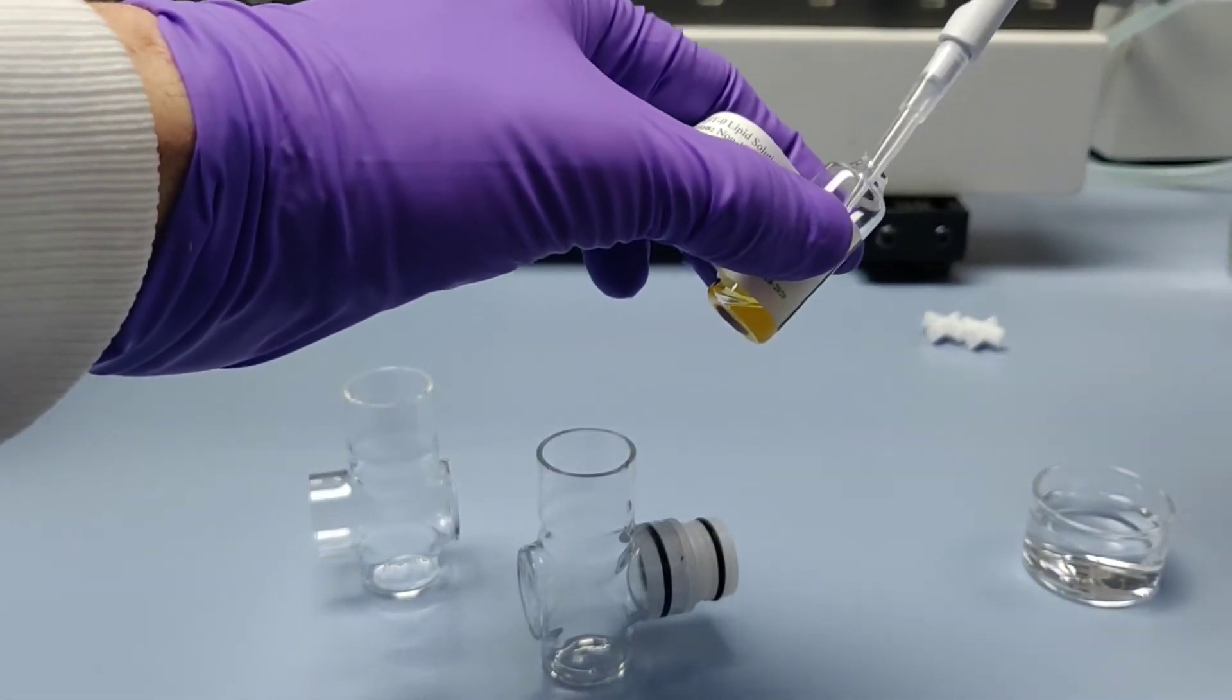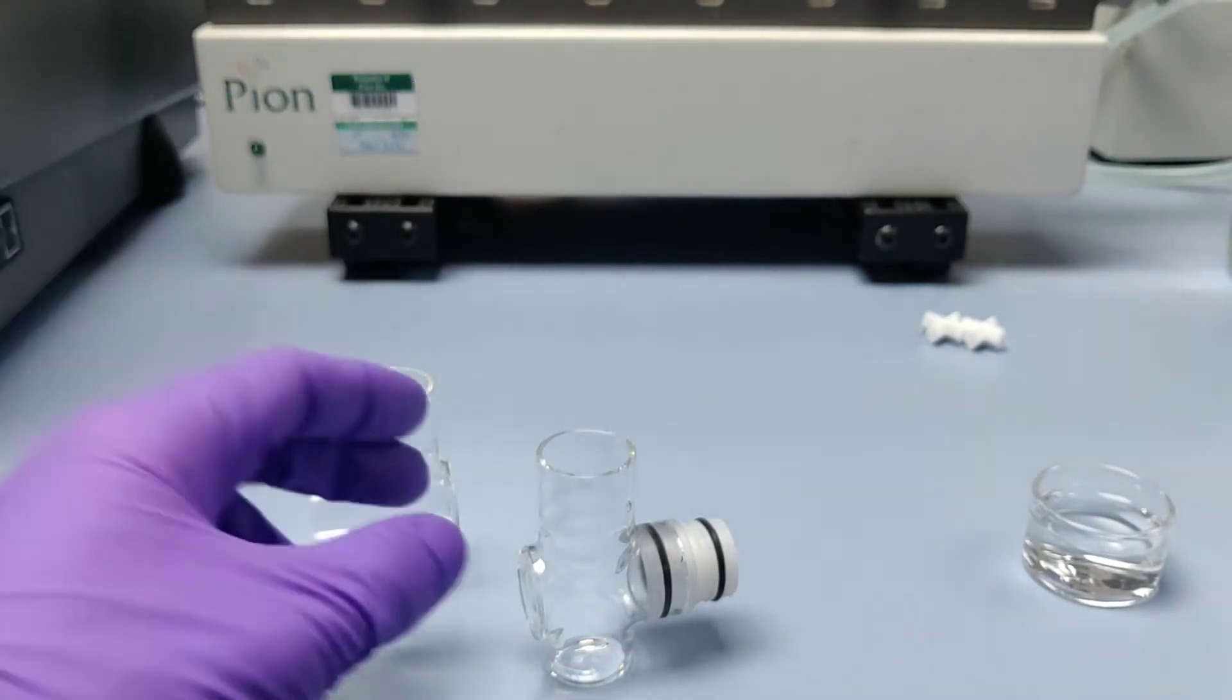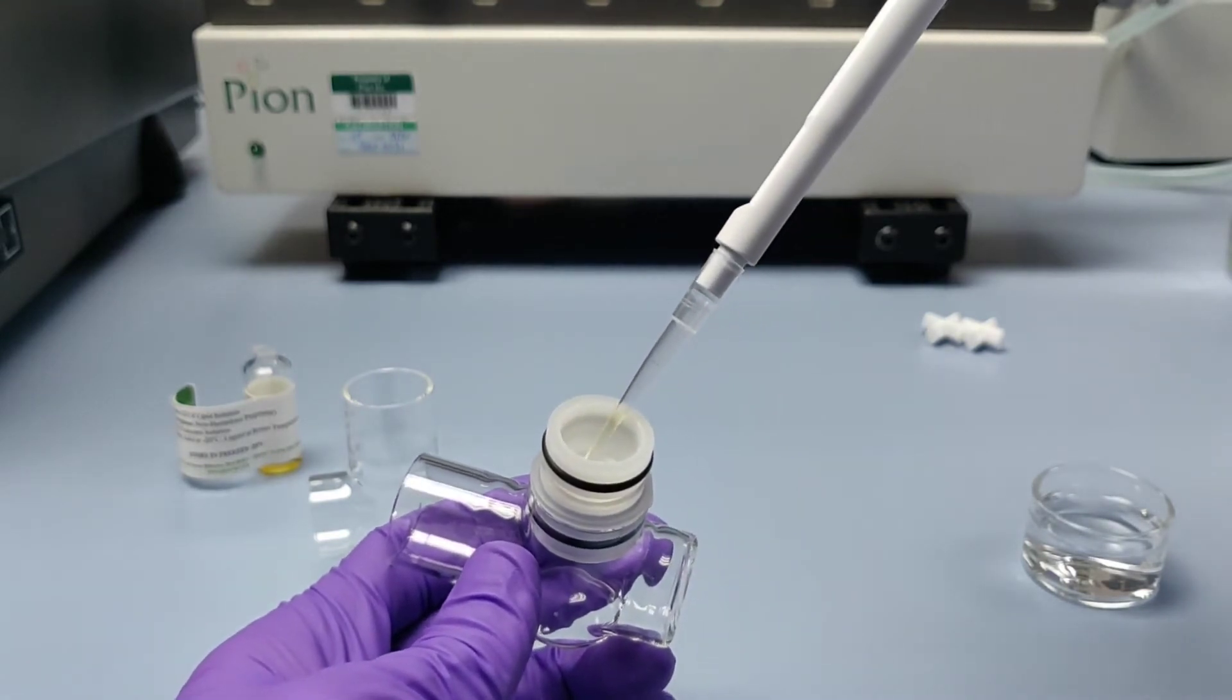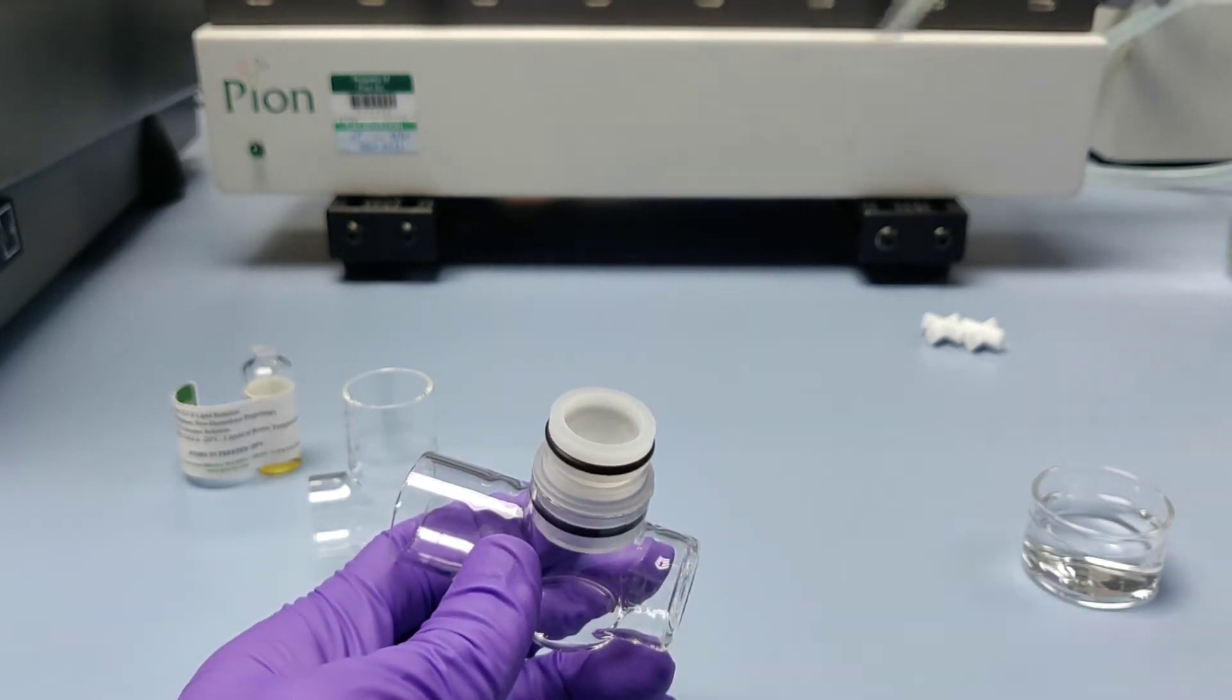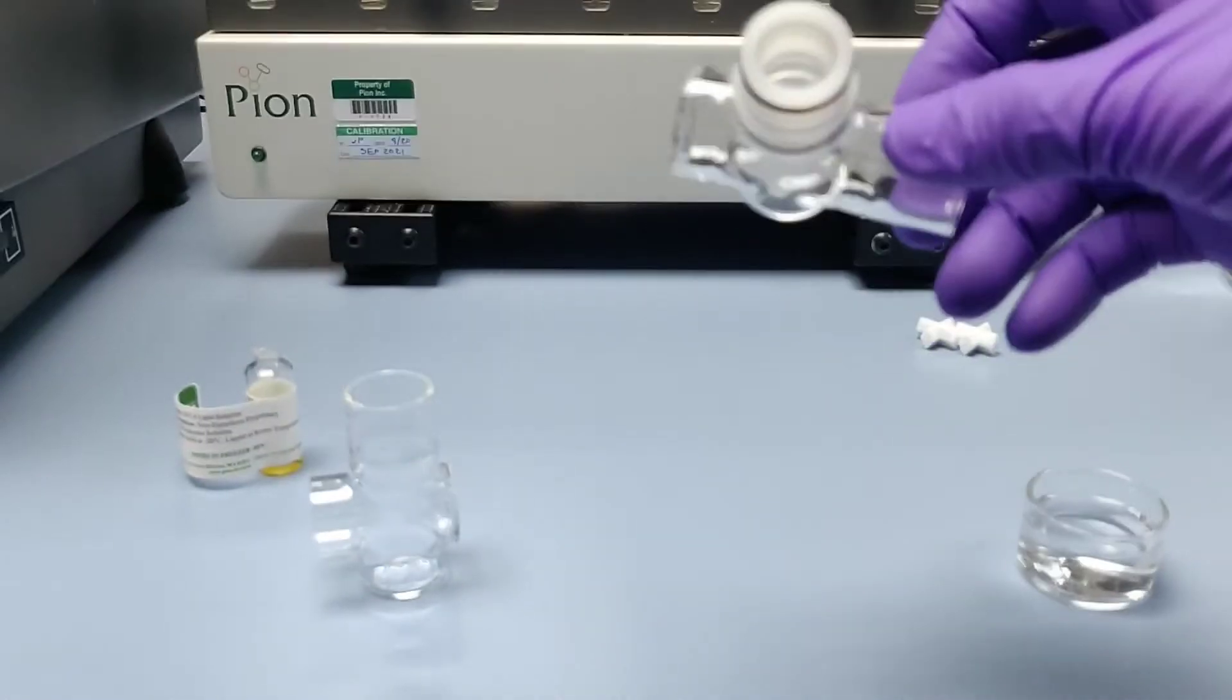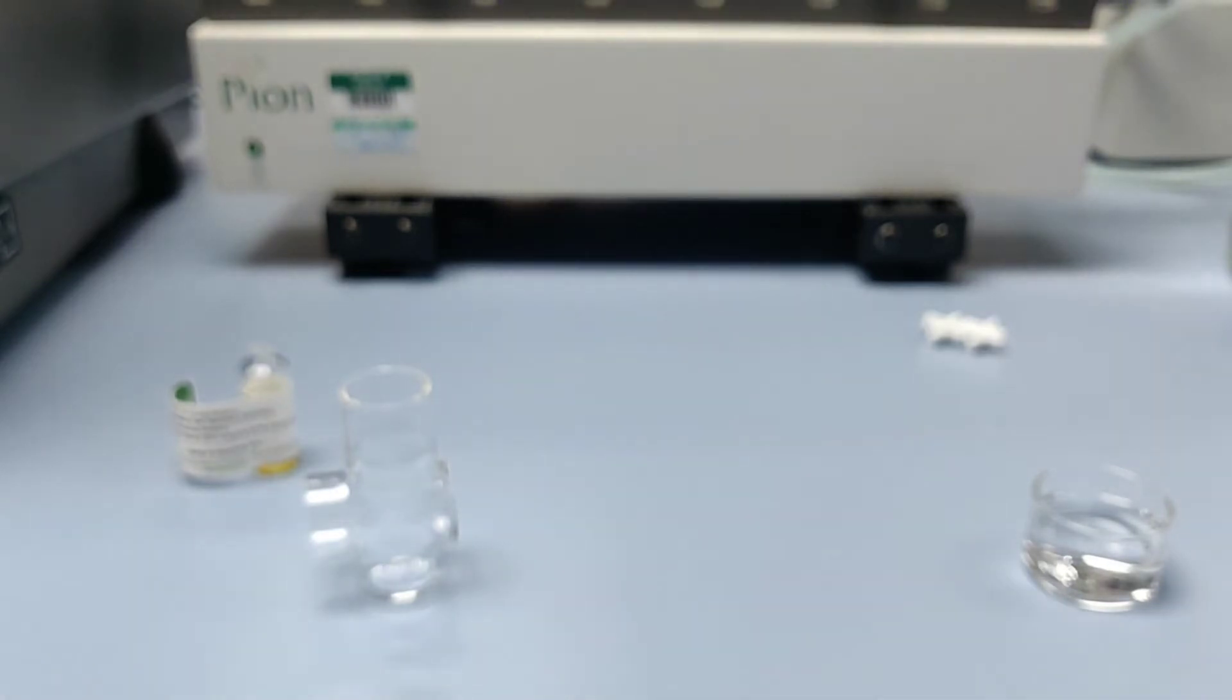At this point, we can paint the membrane support with the GIT lipid solution. 25 microliters of GIT lipid are pipetted onto the membrane and distributed to ensure complete coverage. Once fully coated, the membrane will have turned completely translucent, and from this point onwards, this is a time-sensitive procedure.